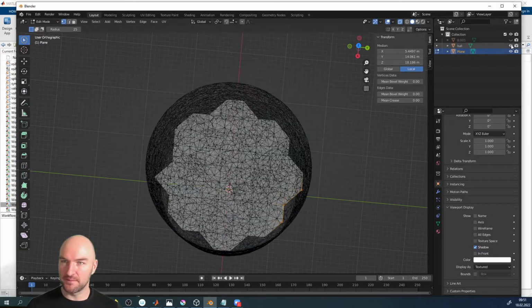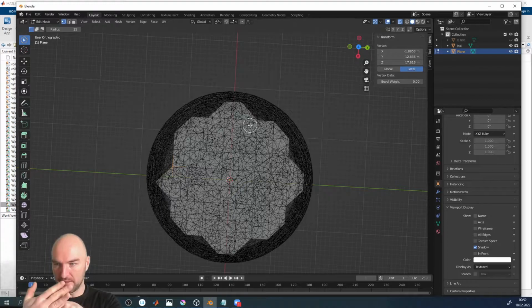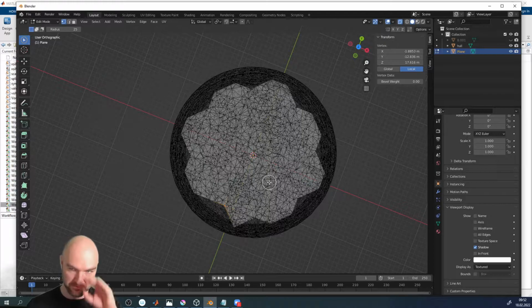Let me switch on the hull again. By looking head on, you always have to remember, if you move a vertex, it will move perpendicular to your view plane. If I look this way, it will move up and down, which is not great for our grain boundary. If I look head-on from here, it will move in my head-on plane. We'll move stuff later on anyway, programmatically as well.